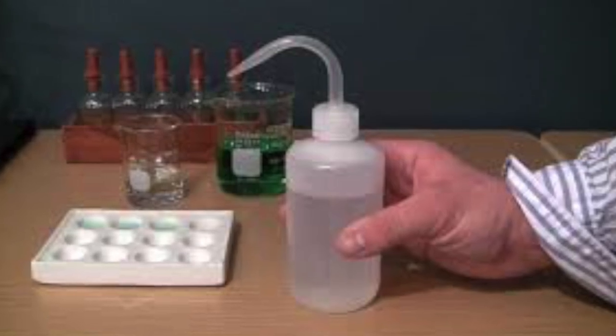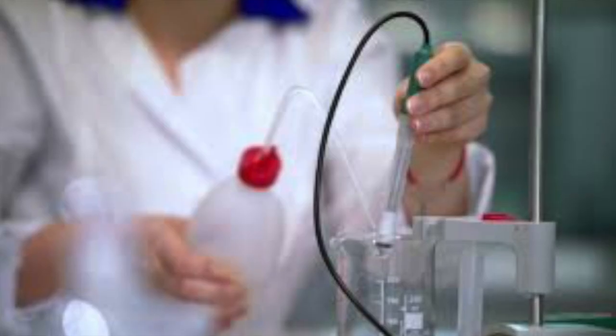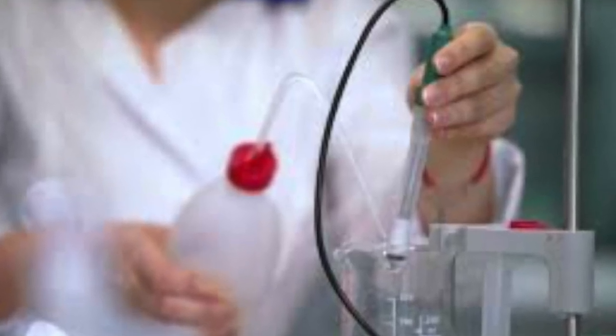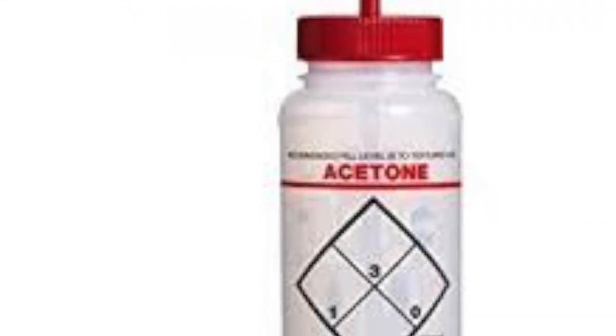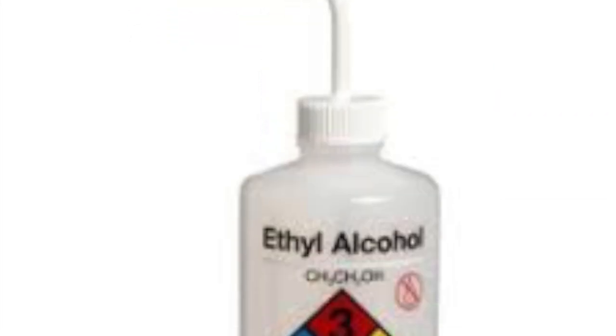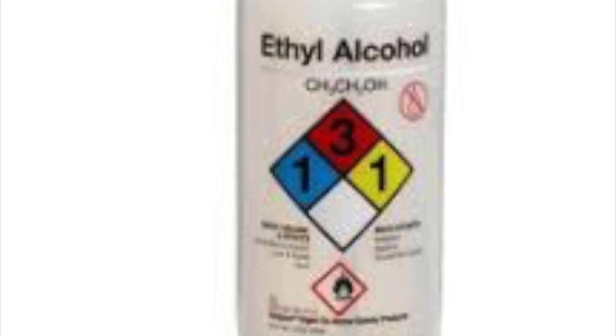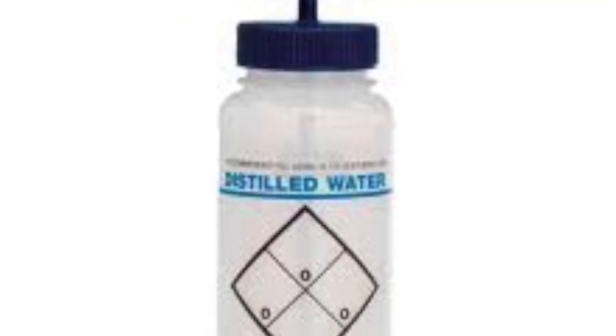The most common types of wash bottles are acetone, ethyl alcohol, distilled water, and tap water. Each bottle's cap is color-coordinated according to the type of substance contained within it. Red is used for acetone, white for ethyl alcohol, blue for distilled water, and clear for tap water.